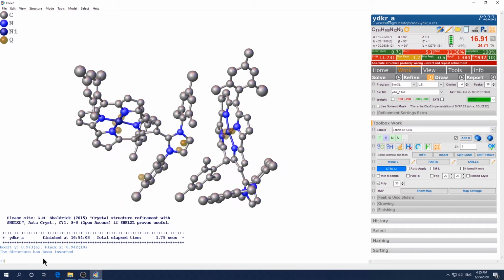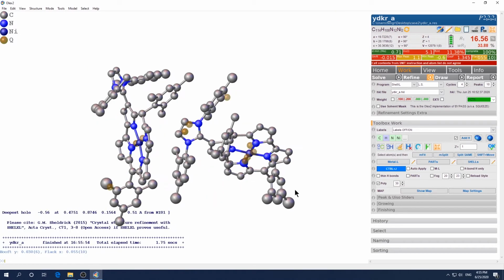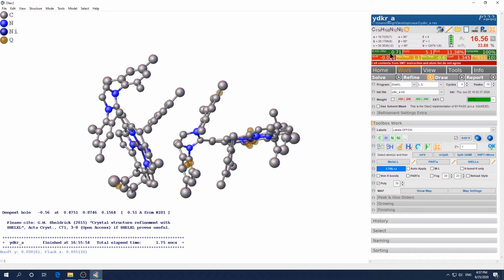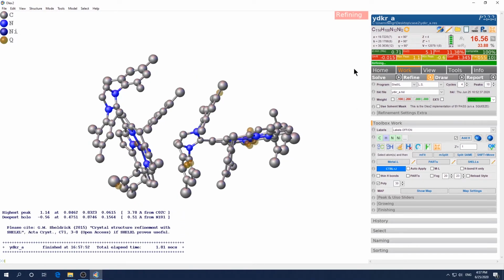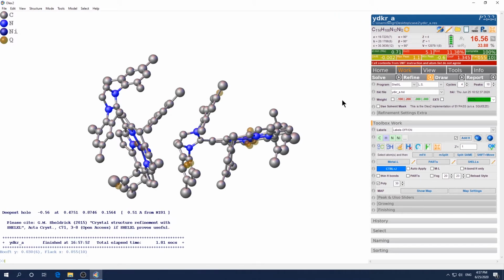Okay, just enter. Then you Control R to refine. Okay, now it takes effect. So basically, it's close to 0. If it's ideally 0, that means there's no problem. It's slightly away from 0, indicating there is some issue there. We will take care of that later. Let's refine one more round to see if it will settle down. I bet it will. Yeah, good.